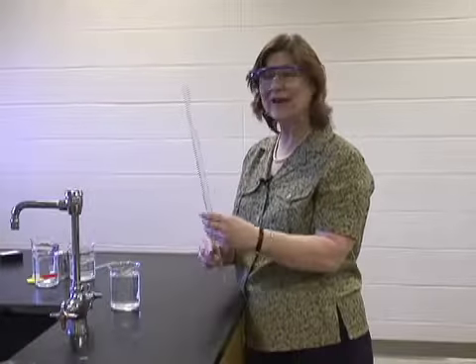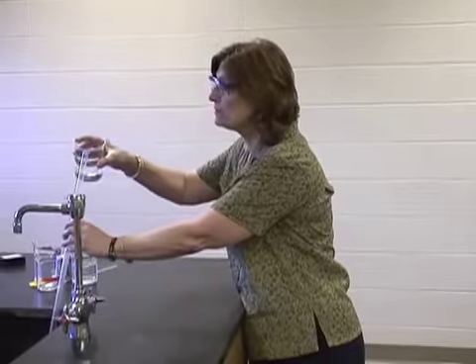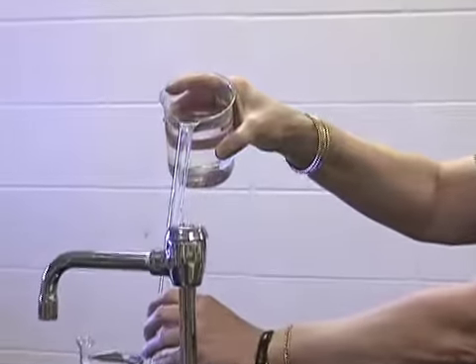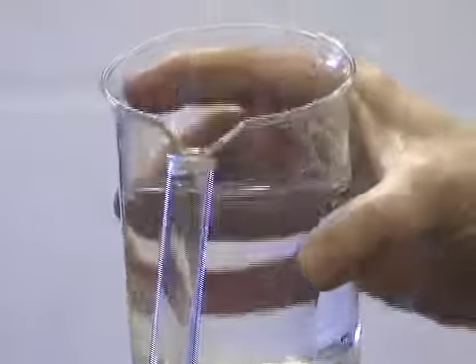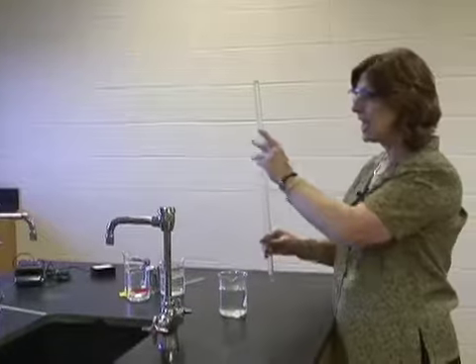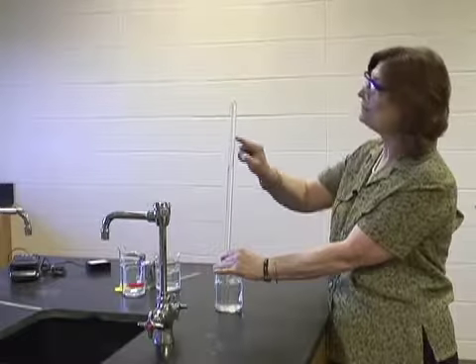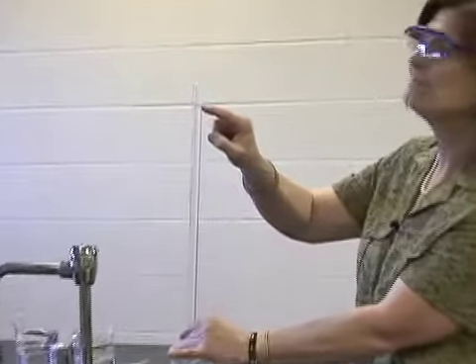This is so much fun. Well, I take my eudiometer and I'm going to practice doing this with just water first so that I know how it's going to work out for when I do it with the acid. So I'm going to pour some water from this beaker and fill this tube all the way up to the top because I want to start with it all the way to the top and see what my technique is. And I'm going to flip it upside down and put it inside, and then there's an air bubble here and my volume is about 4.5 milliliters here.